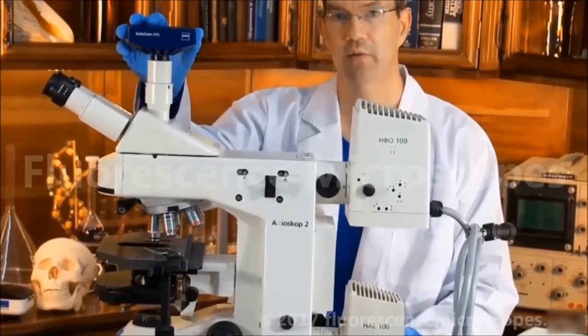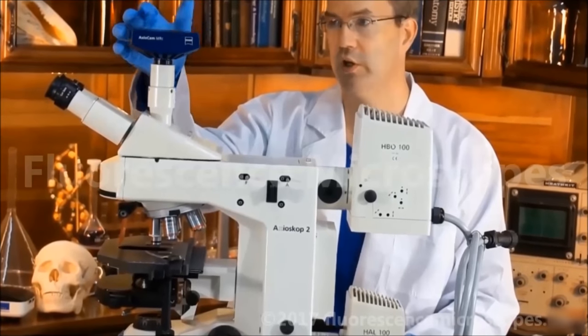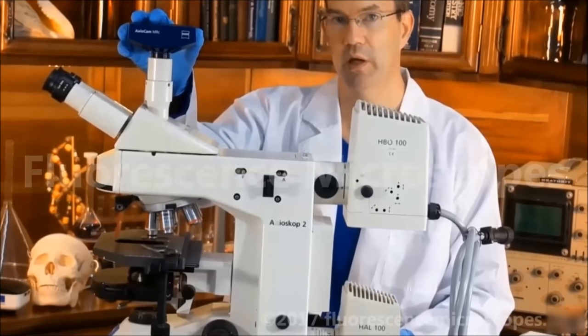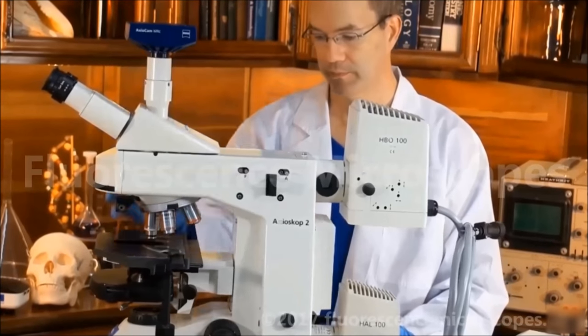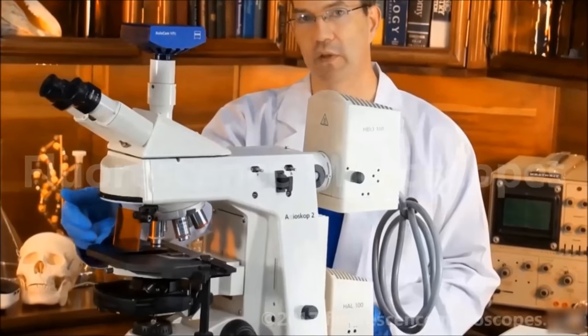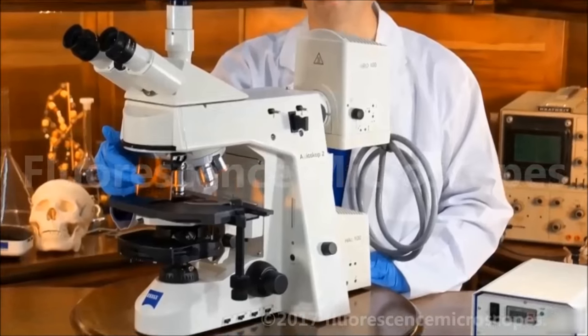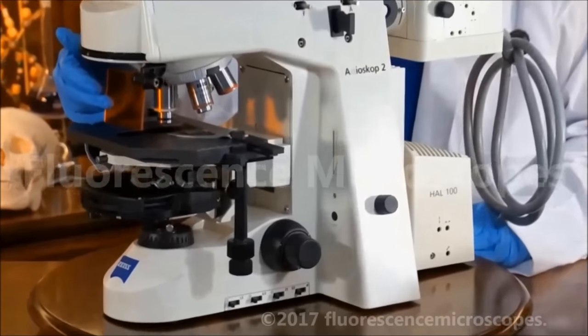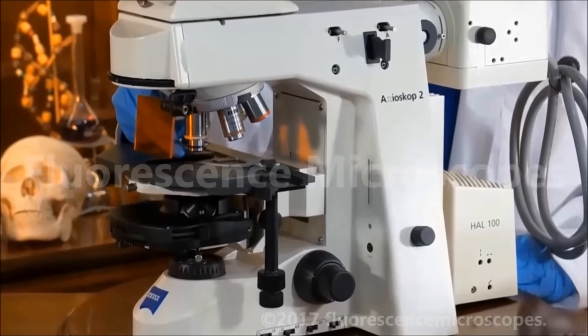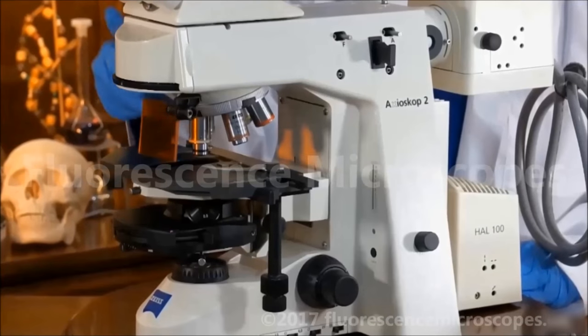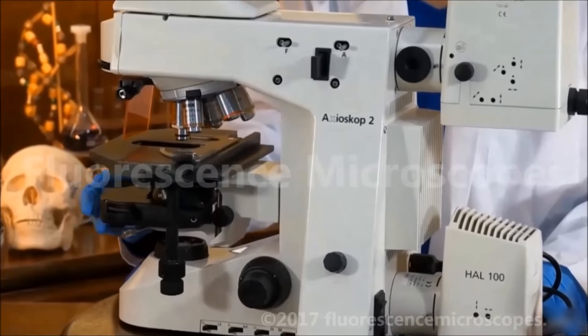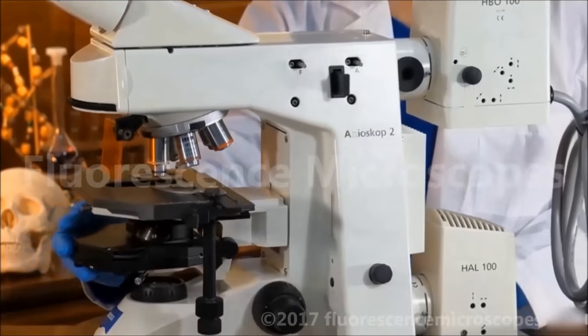You'll have to look at the actual specifications to see which, if any, cameras are included with this microscope. We have a UV filter on the front. This blocks extraneous light reflecting from the slide, and we have a condenser on the front.